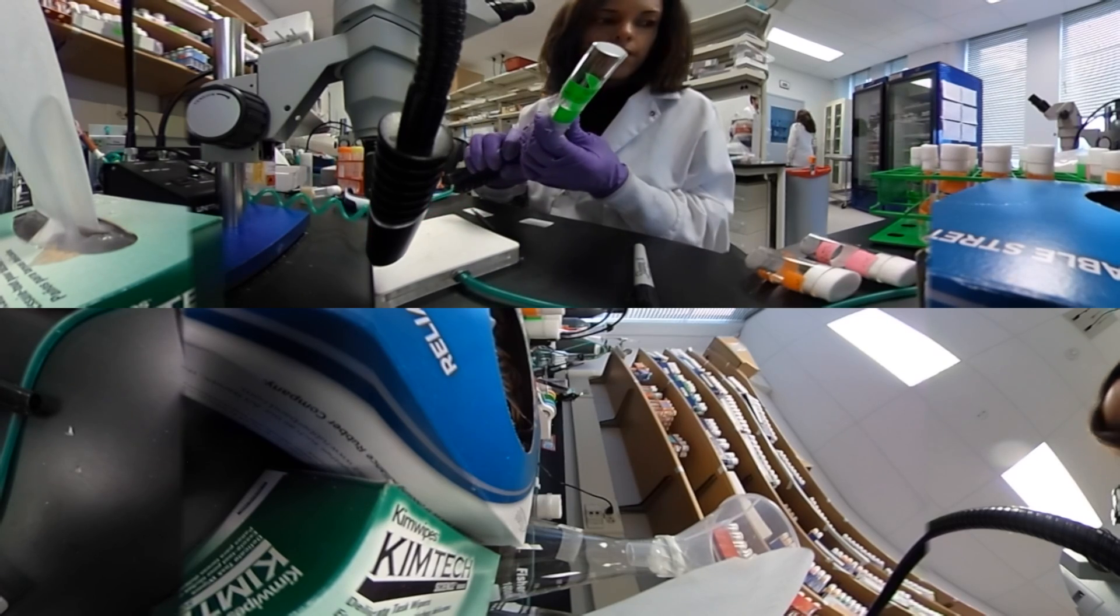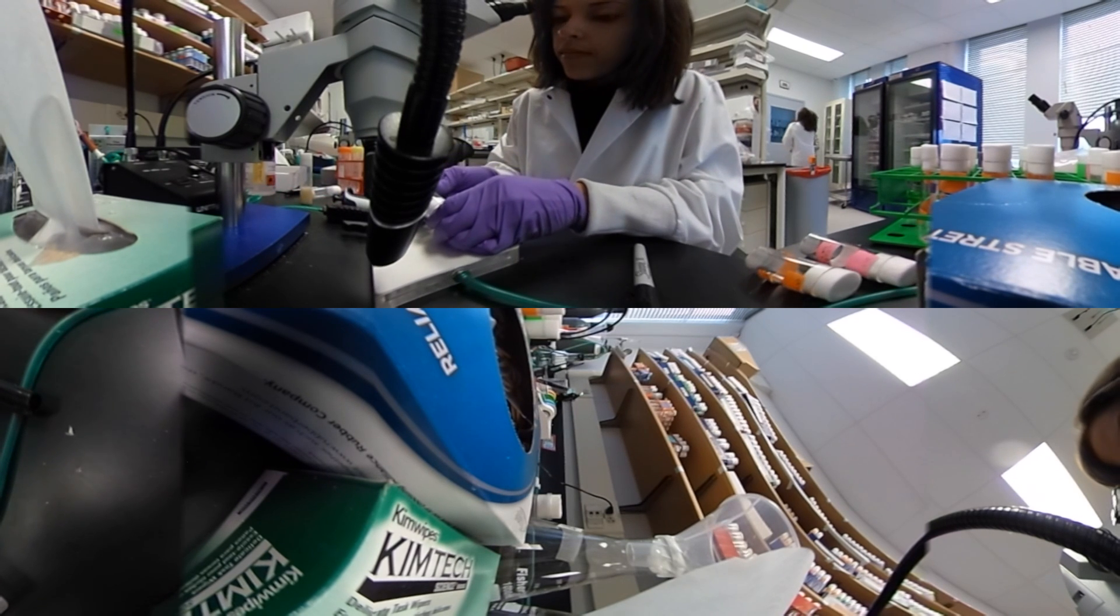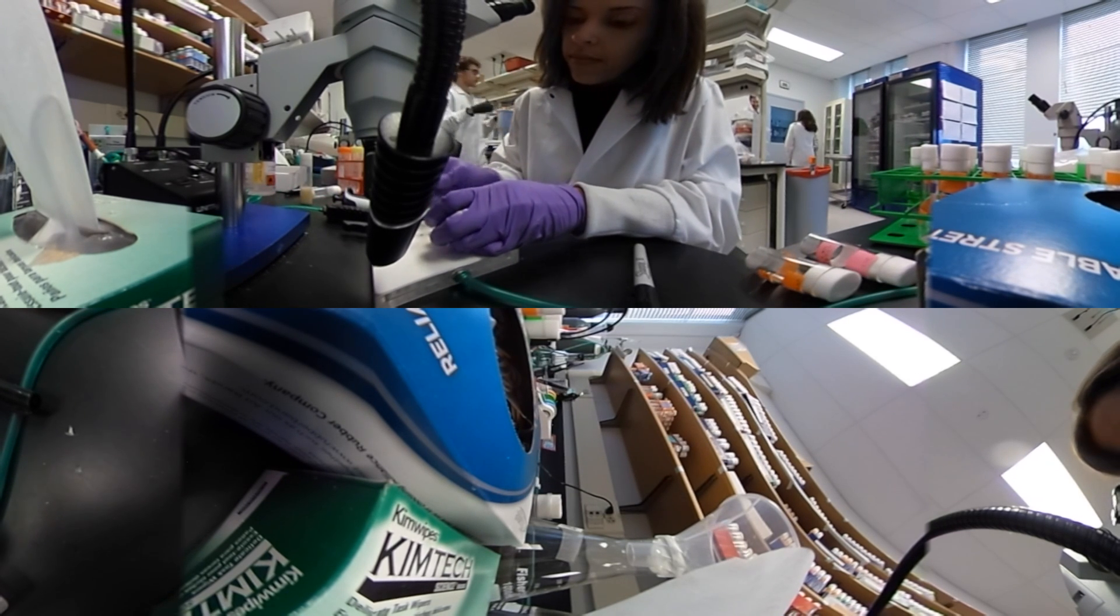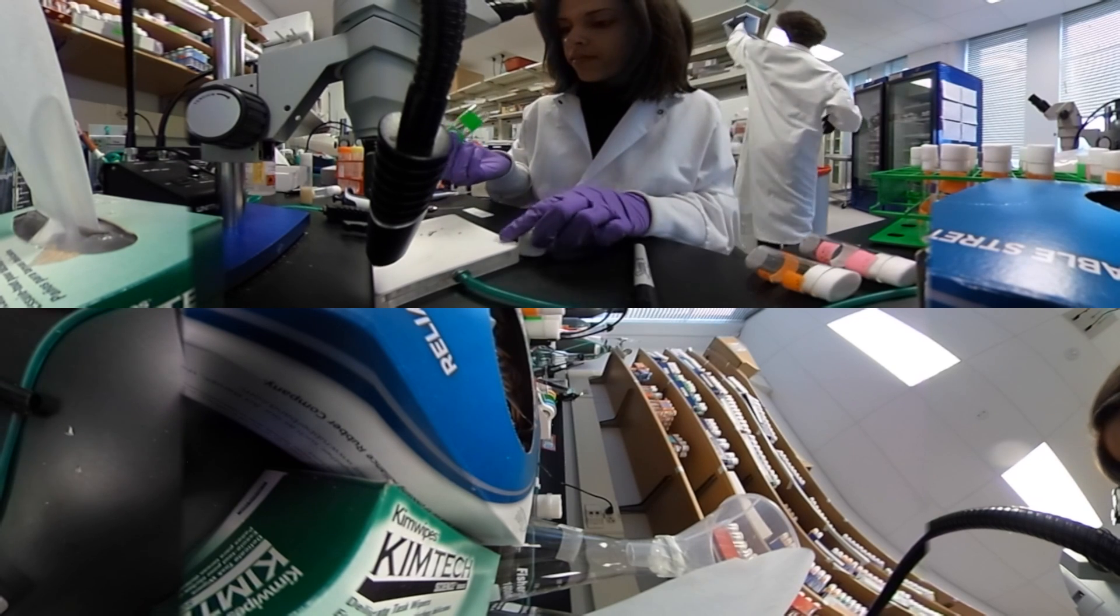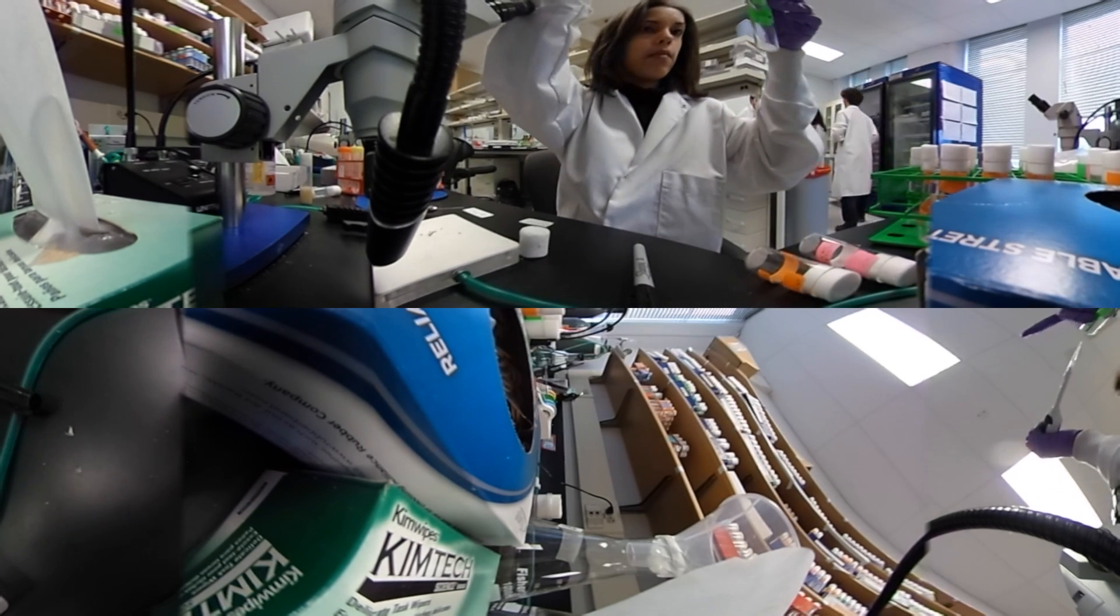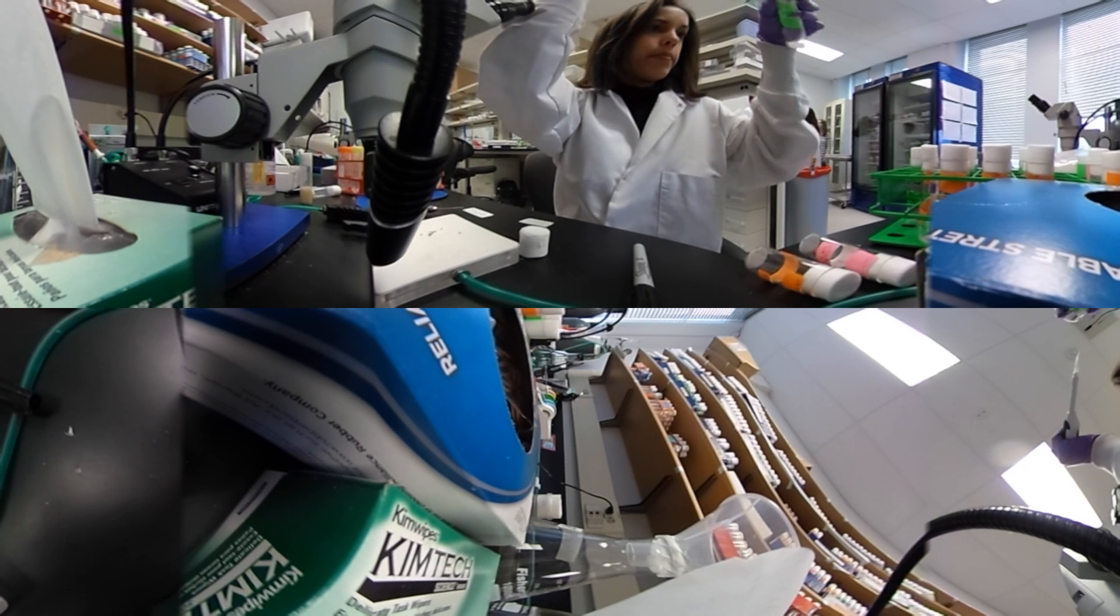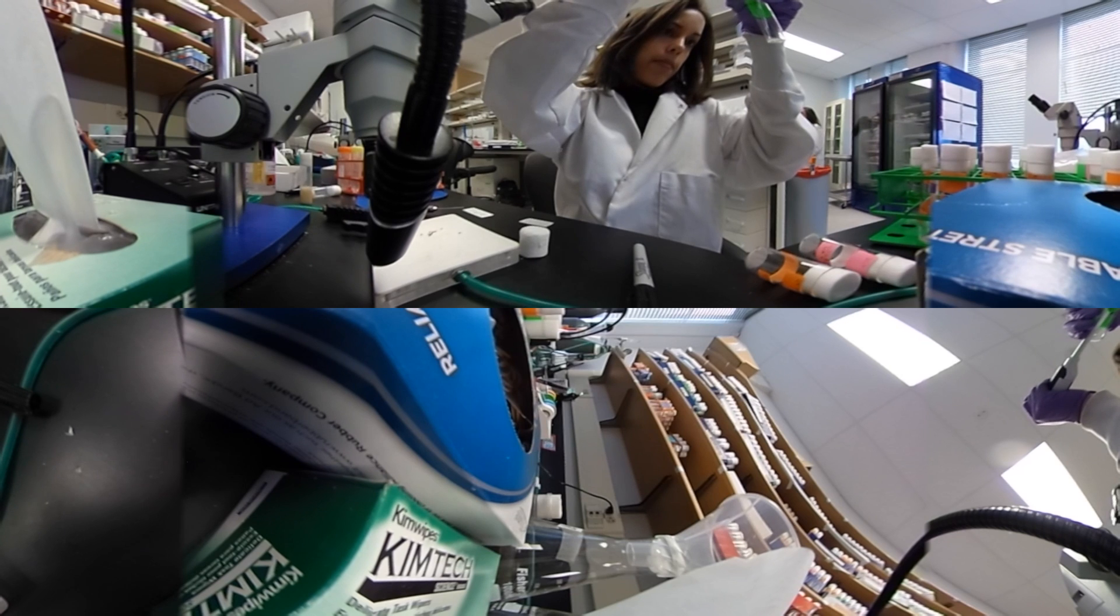My laboratory is interested in investigating neurodegenerative diseases. To do that, we're using the fruit fly Drosophila melanogaster to model these neurodegenerative diseases and figure out the underlying cellular and molecular mechanisms that are causing these diseases in humans.